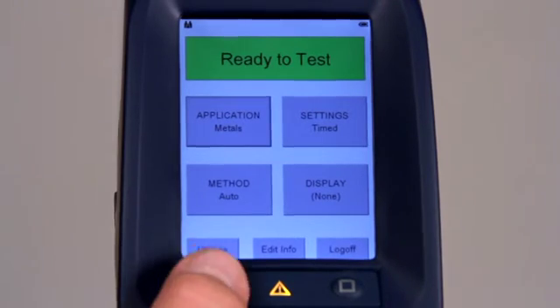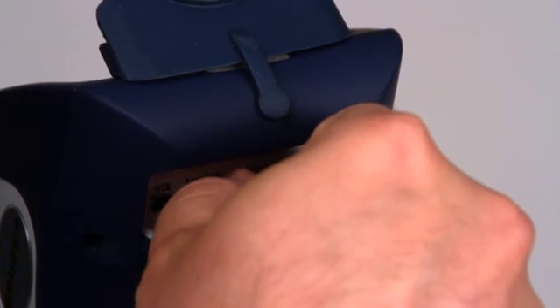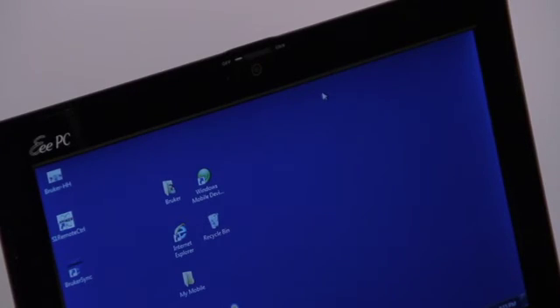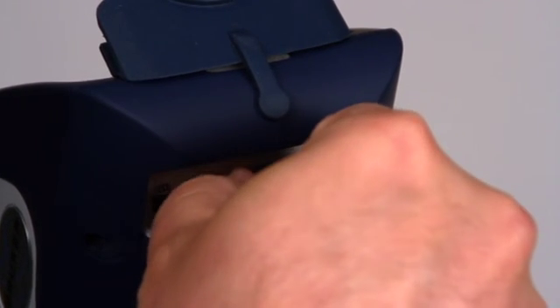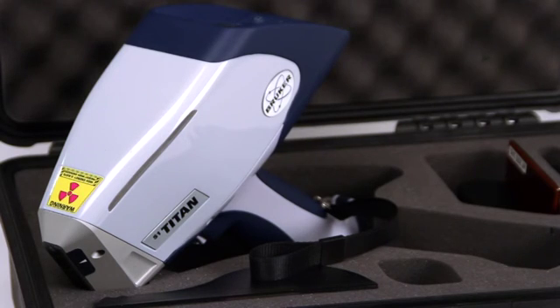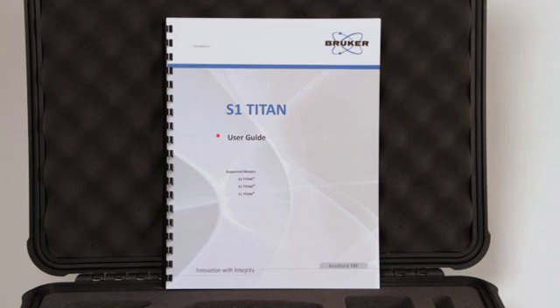To shut down the instrument when you've completed your work, simply press the power button. The easiest way to transfer the data from the analyzer to a computer is to store the data directly on the USB flash drive supplied with the analyzer. Remove the USB flash drive from the analyzer and insert it into an unused USB port on your computer. You can now copy the results.csv file from the USB drive to anywhere on your computer. The file can be opened using Microsoft Excel. In order to store your future data directly onto the USB flash drive, simply insert the USB flash drive into the flash drive slot on the back of the analyzer. Once the flash drive is installed into the instrument, the software automatically stores all data on the flash drive. If no flash drive is installed, the data will be stored in the processor memory and can be transferred to the USB flash drive using the system software. See the user guide for instructions.